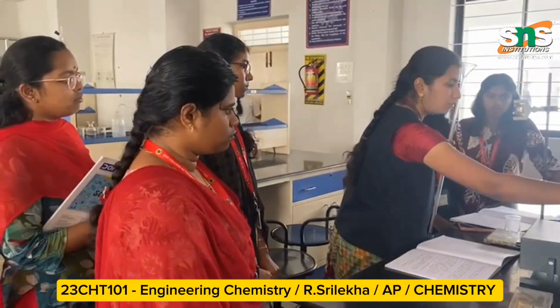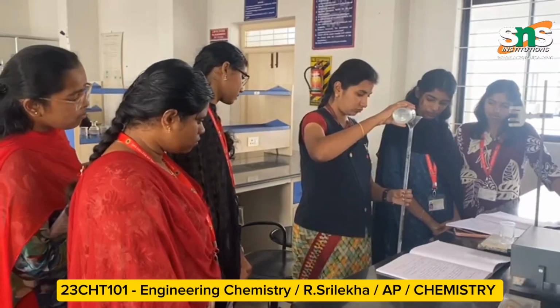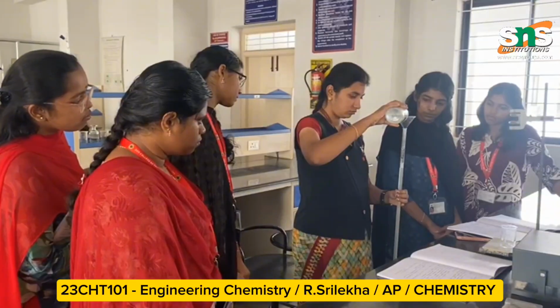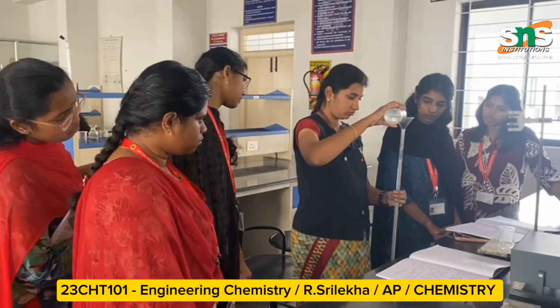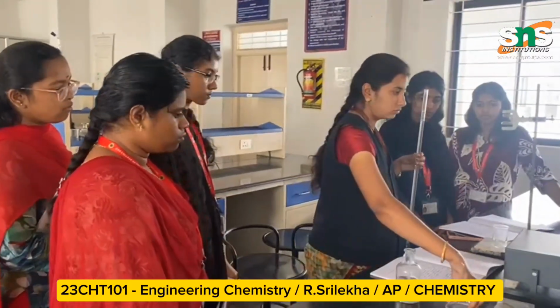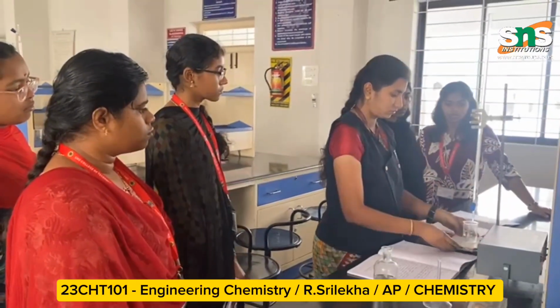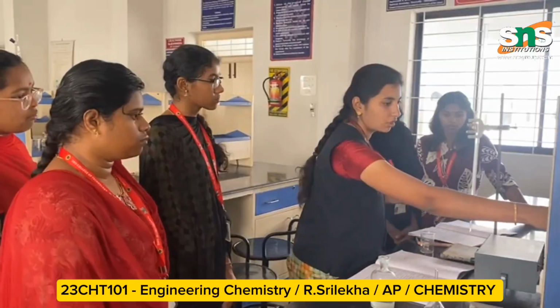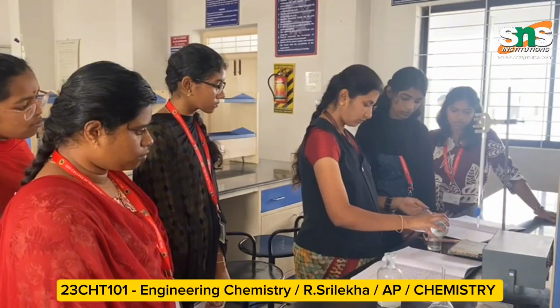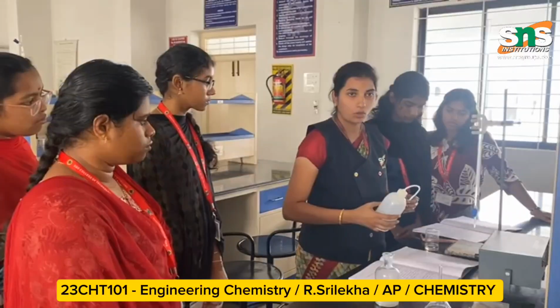Now I am filling the burette with sodium hydroxide solution from 0 ml to 50 ml, and taking the pipette solution of the mixture of acids, that is HCl and acetic acid. To dilute this solution I am adding 20 ml of distilled water.